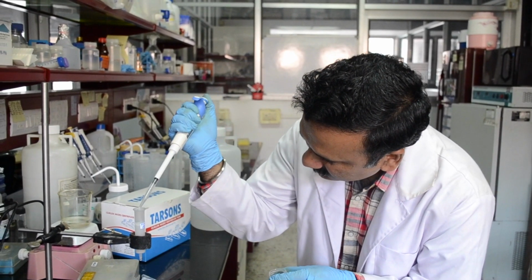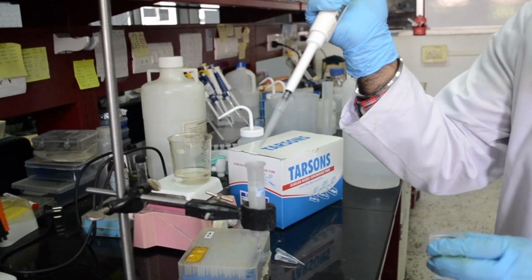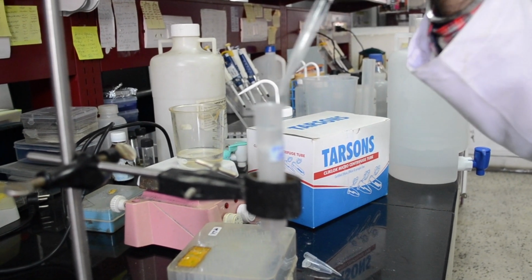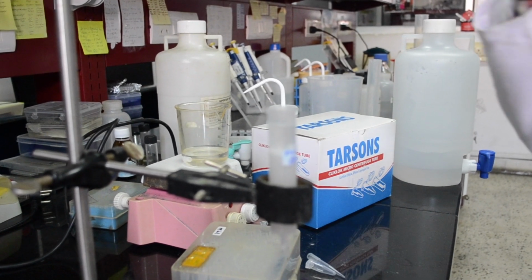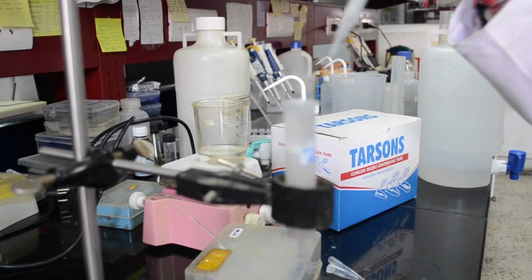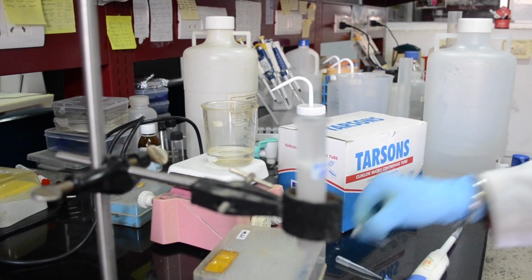So now it has reached this level, and you can simply fill the column with your water up to the top, and then you start collecting the fractions.